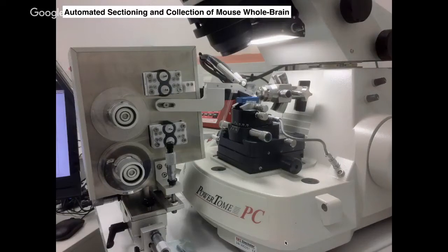Now, with the serial block face approach, I was working for quite some time with others trying to get that to work. Ultimately, or currently, it is not working. However, about 1.5 years ago, I decided to focus my attention on the serial sectioning approach. It seemed like it might be better suited for cutting through large samples. And so I purchased one of these Atumtome machines.